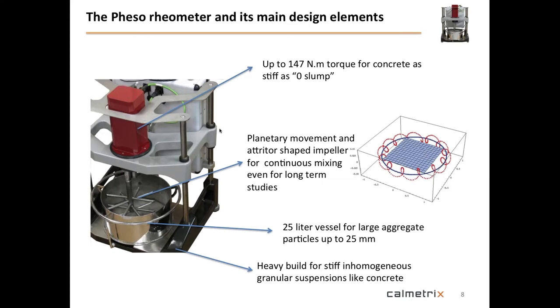And of course, as we mentioned earlier, this has to be built as a heavy structure. And the structure overall of this rheometer weighs about 130 kilos, which, yes, is quite massive. It needs a couple of people to move it back and forth, at least. But in this case, it really helps us to keep the vibration low and get good precision in the measurements.